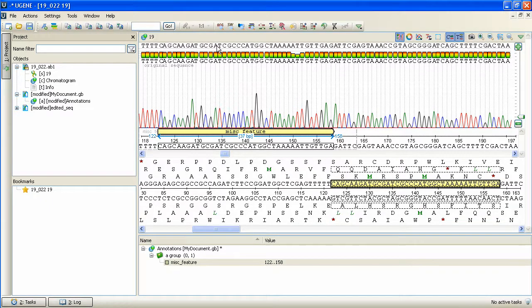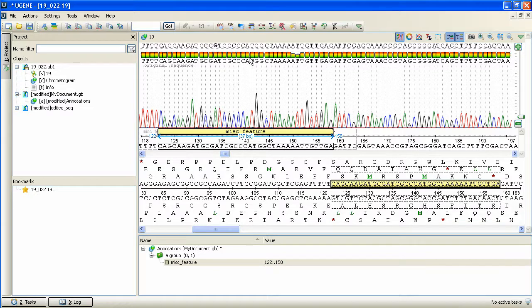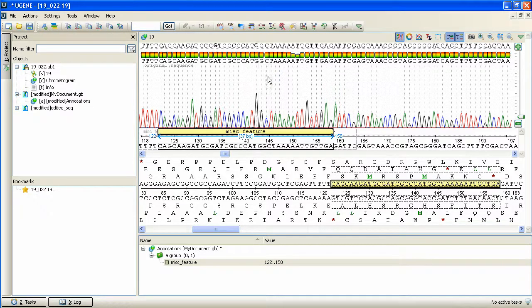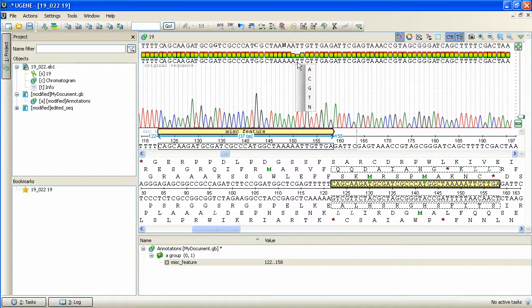To edit it, we simply click on a symbol and then select our own variant from the drop-down list. The changed symbols are highlighted with the bold font.